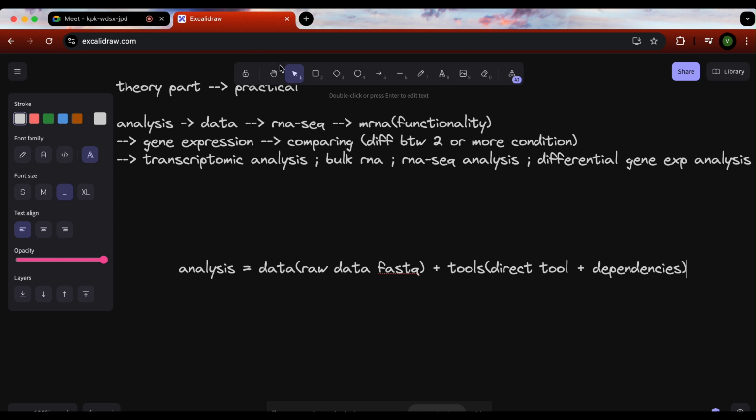Now why I'm telling you all this: even when you install R, which I'm going to tell you about in our future sessions, any tool always works with a lot of dependencies, something which is required for that tool to work, right? Because of these dependencies, if a certain dependency is missing in your system, you will get an error.